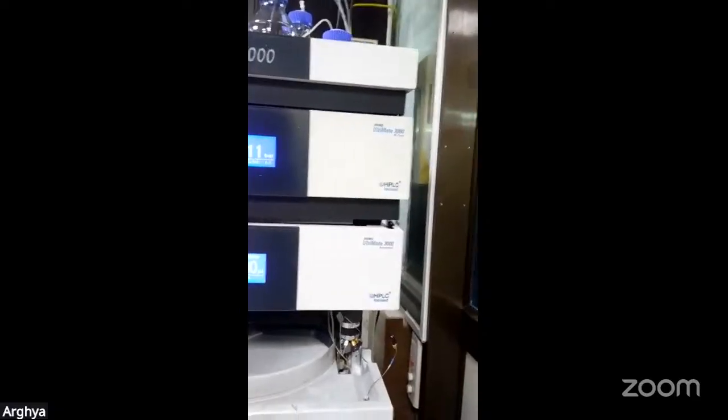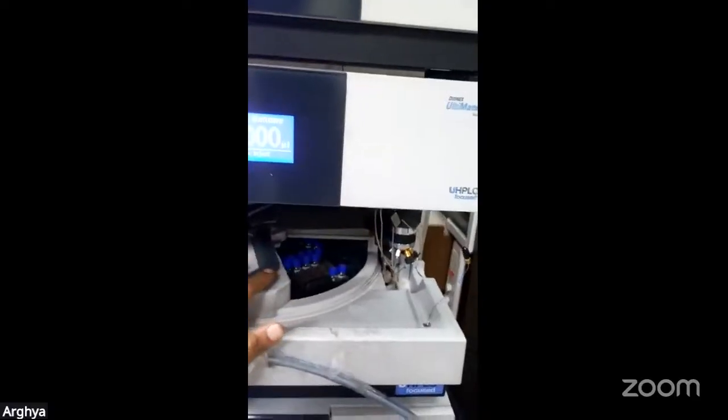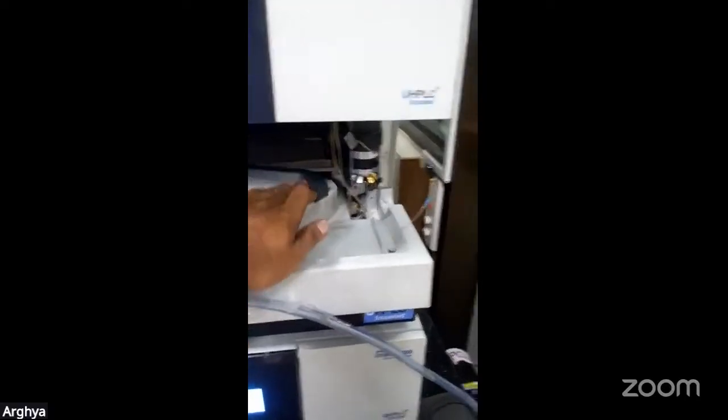This is one more instrument, which is the Orbitrap Q Exactive. This is an UltiMate 3000 HPLC. The samples can be placed in the sample compartment. We can generally use it for small molecule interactors as well as metabolite interactors or protein-metabolite interaction studies.